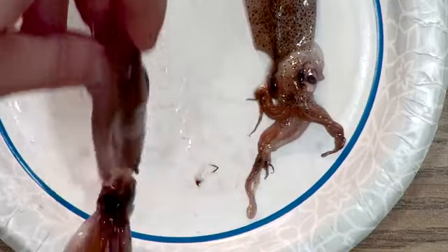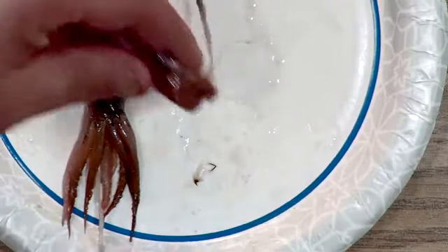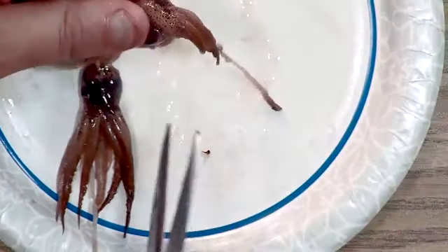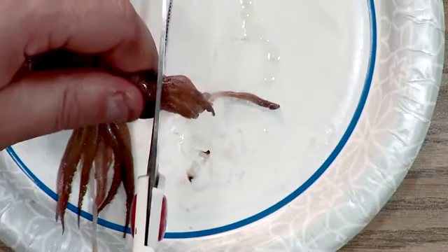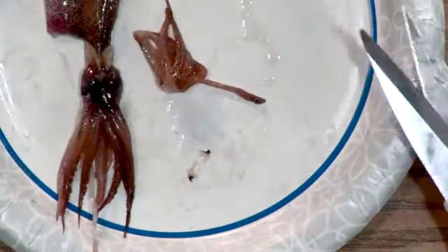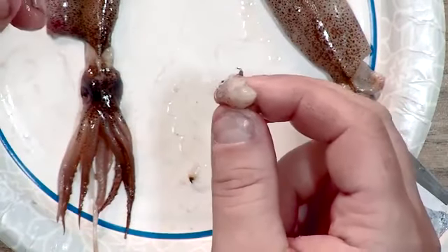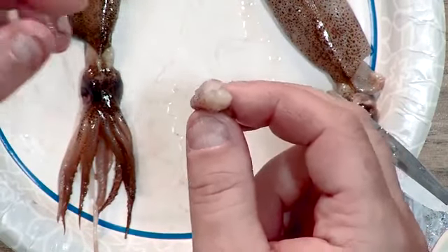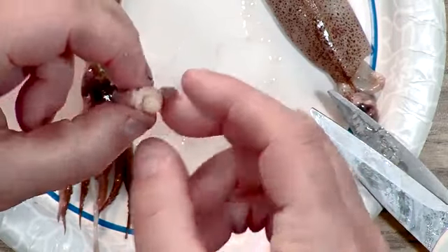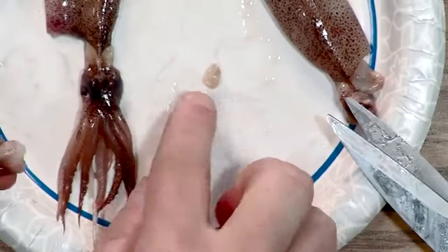Another way to do this, I'm going to show on the counterpart here. And this is the way I would do it if you were preparing food. I can just come in here with scissors, and I'm just going to cut the bottom off there. Now what this does, unfortunately, is cut the nerve cord, but it quite easily makes it so I can extract the brain more intact.